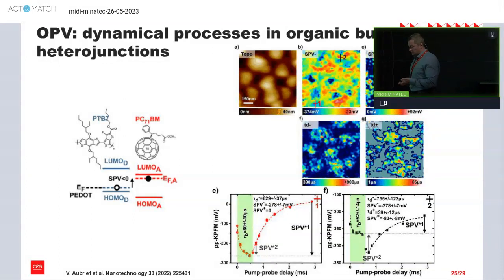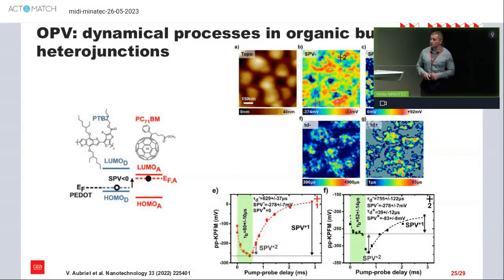We can after change, for example, the fabrication of these organic materials to take into account this kind of parameters. Okay, so this is the interest of this kind of characterization. And by AFM, you can electrically do the measurements in contact mode, and as well in non-contact mode. Both organic and inorganic materials. I did not precise this, but mainly I'm working with non-contact mode here.